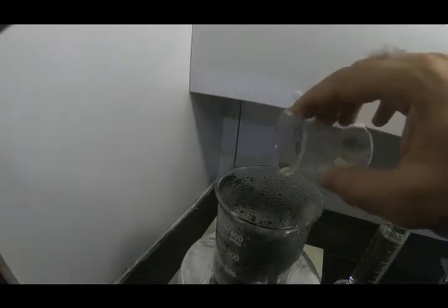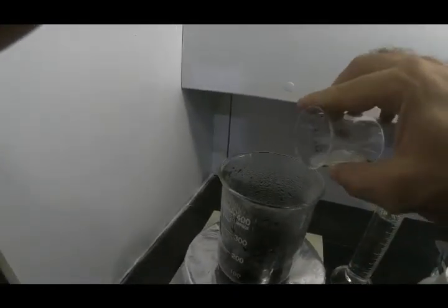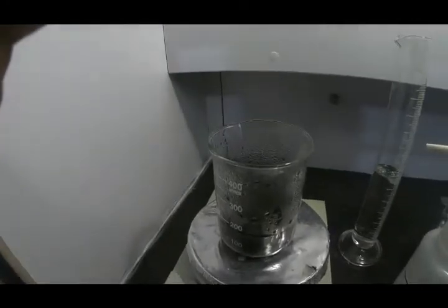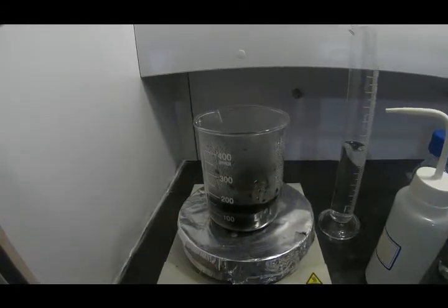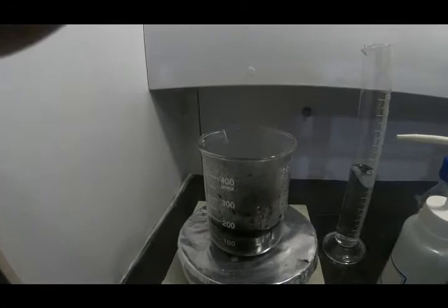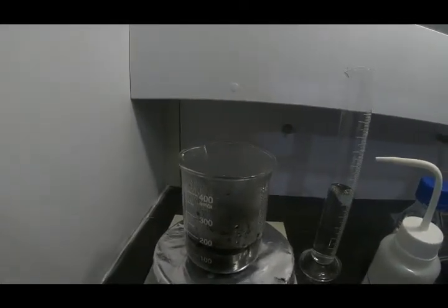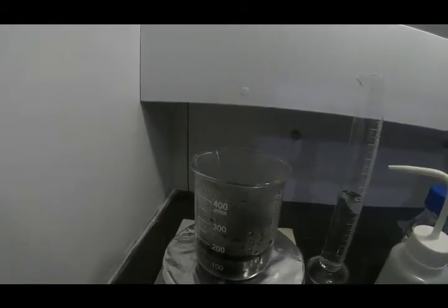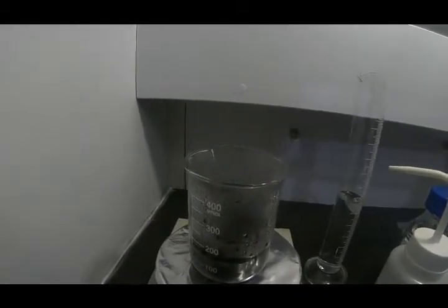I'm just rinsing the rest of it with distillate. Now we are going to let it rest here for 2 hours, but as you saw, the palladium chloride solution is kind of a brown reddish color, but when you add it to the carbon, if you let the carbon settle down, the upper layer should not have any color.